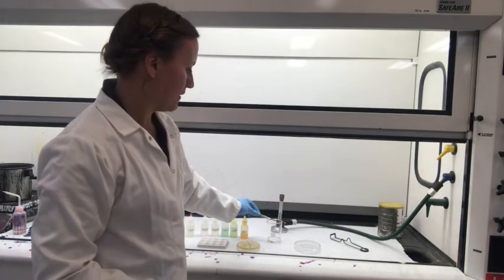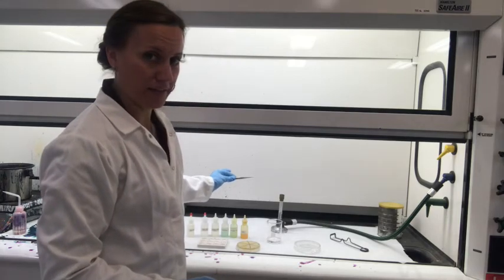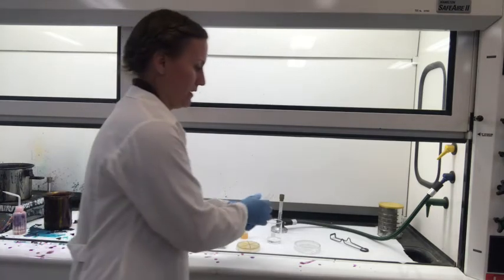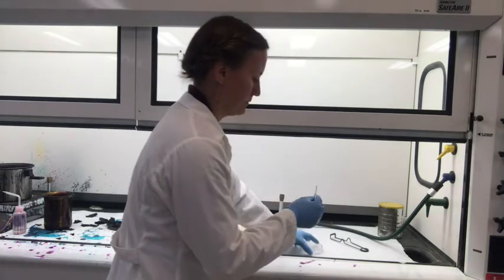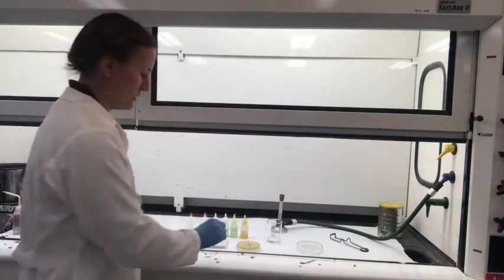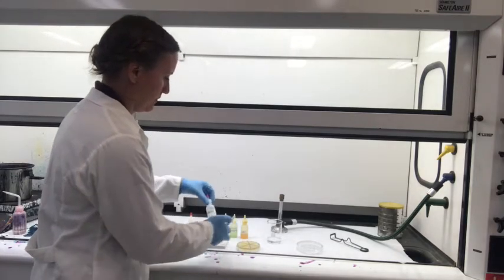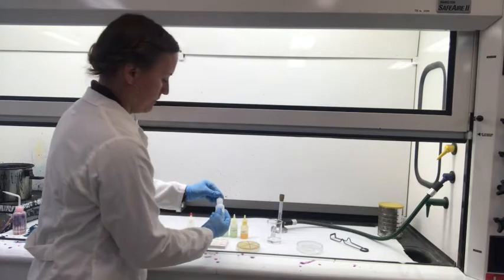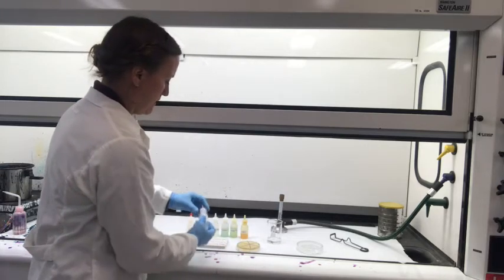So again, with my forceps, I'll pass them through that Bunsen burner flame and allow that ethanol to burn off. Take my sterile disc, set this one in a new well. Again, add my disinfectant.